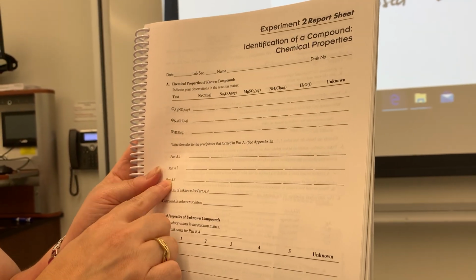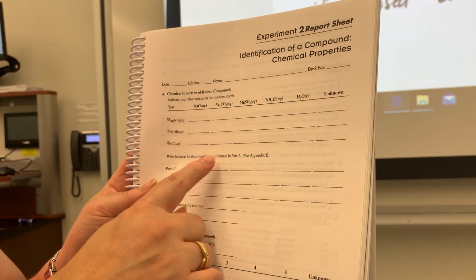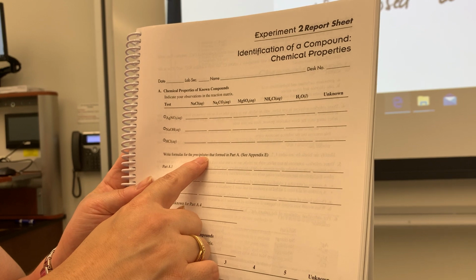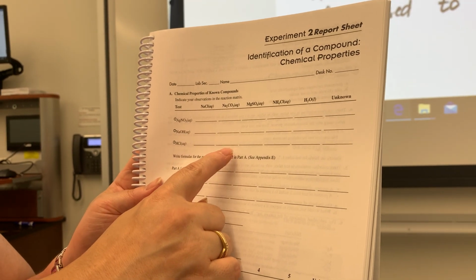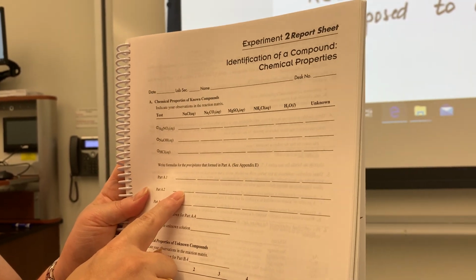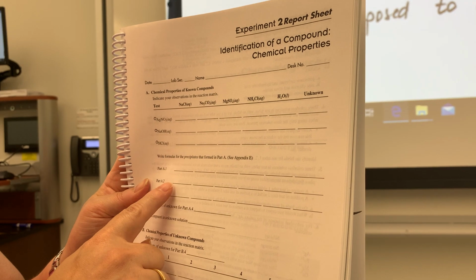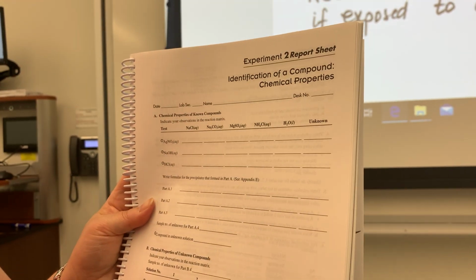And then the second portion here says write formulas for the precipitates that formed in part A. Here, after the word precipitates, I would like you to add "and gases." And then before you fill this portion out, you will have to take a separate piece of paper and write chemical equations for all reactions that you observed as occurring.